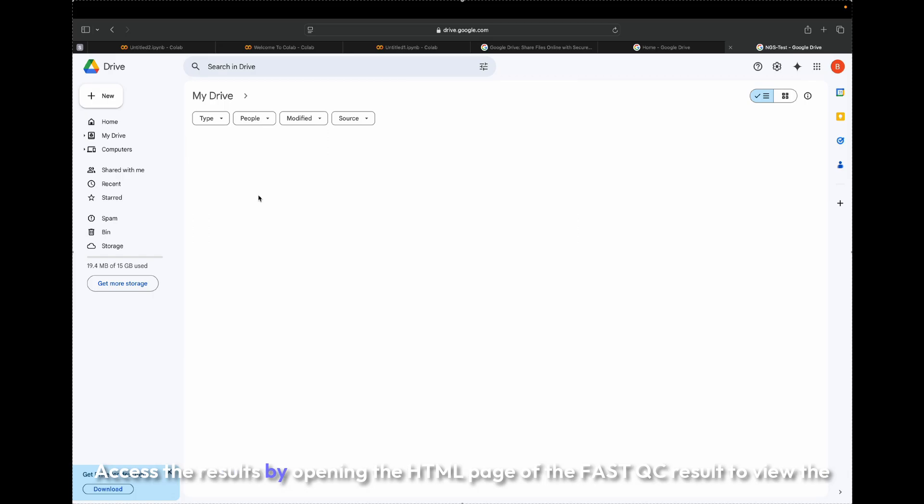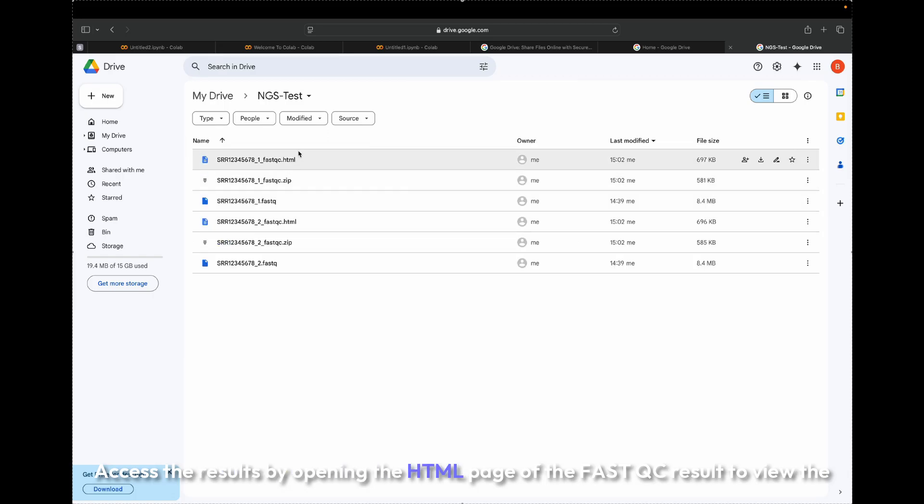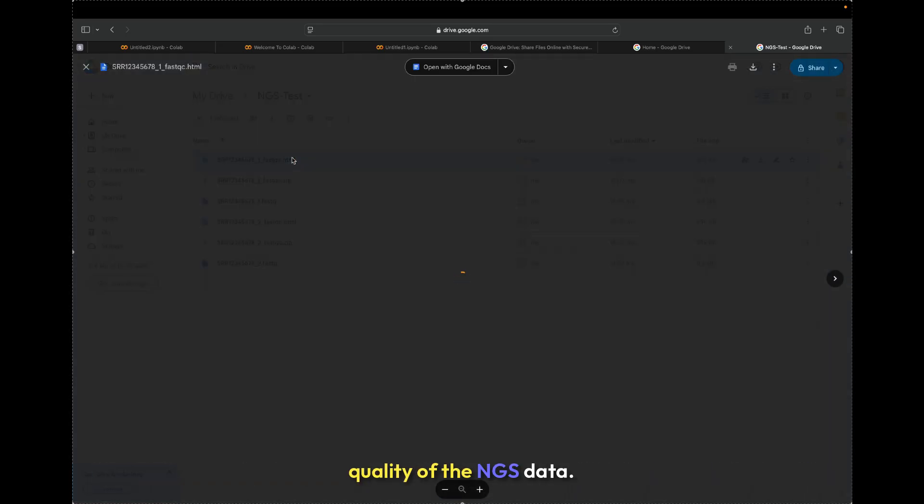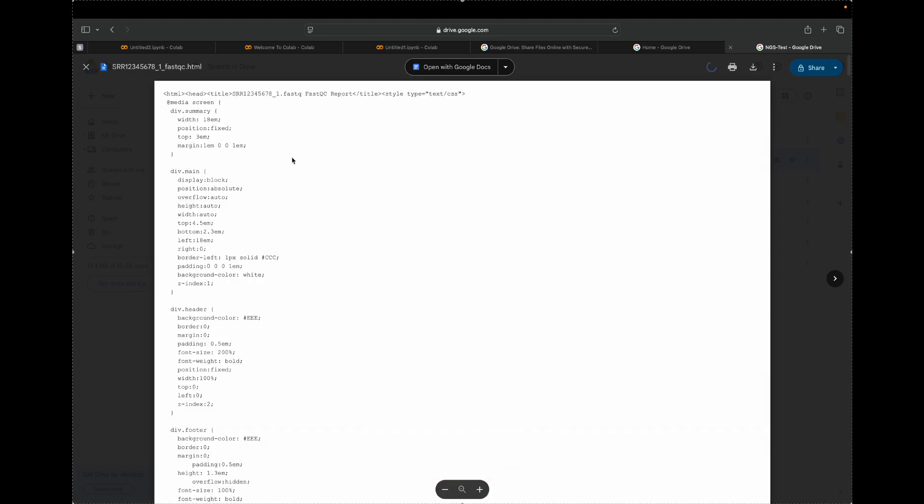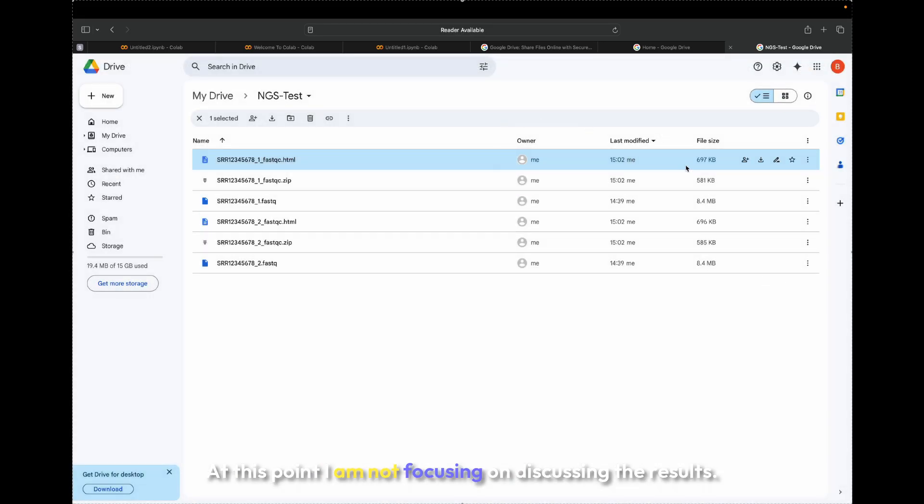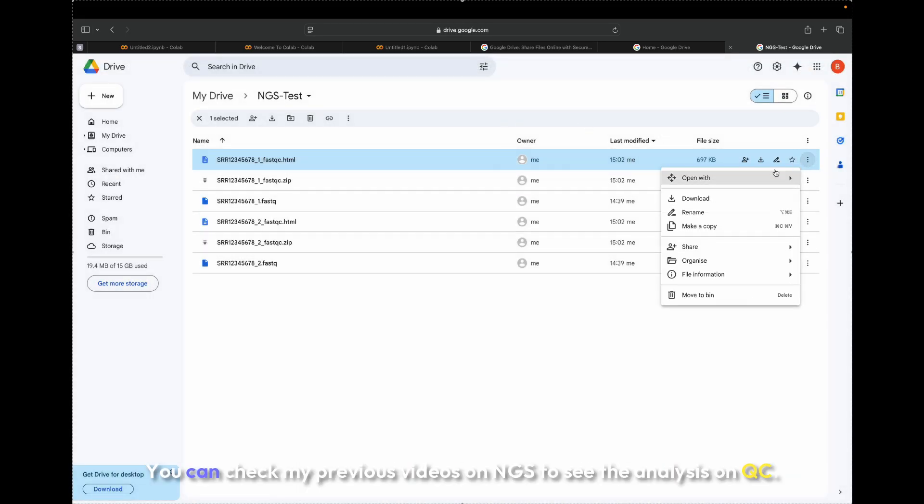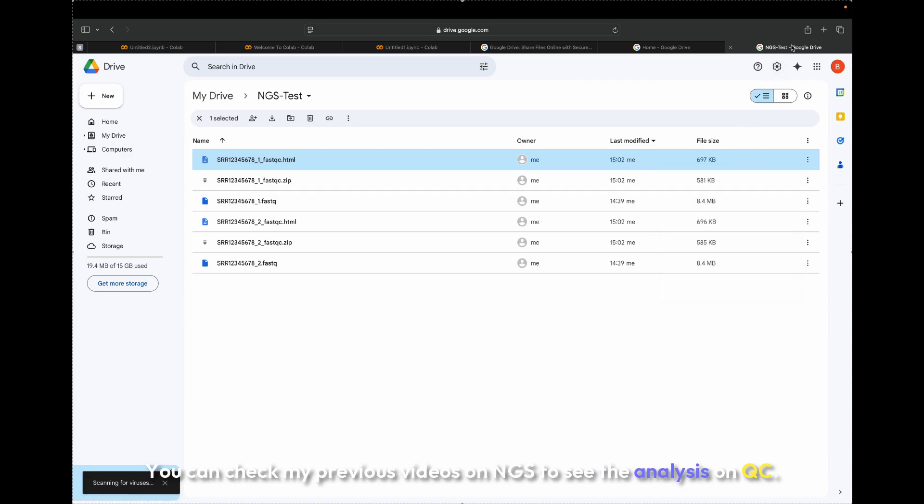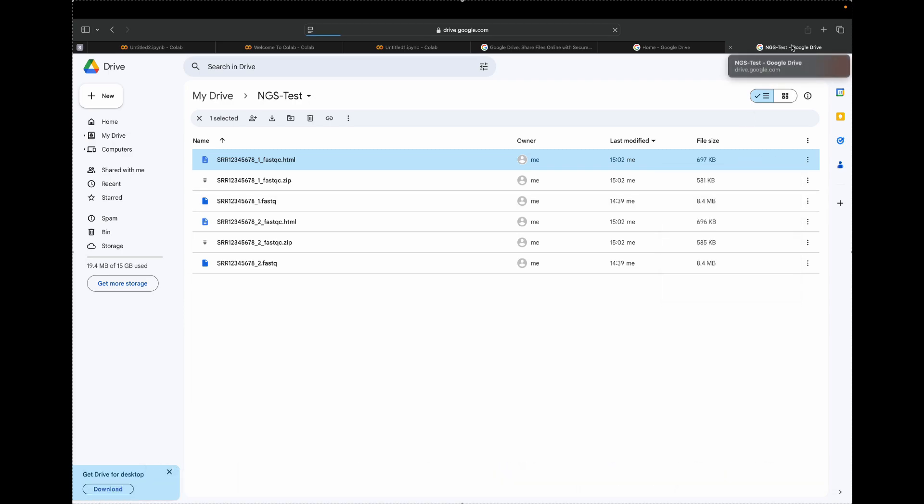Access the results by opening the HTML page of the FastQC result to view the quality of the NGS data. At this point, I am not focusing on discussing the results. You can check my previous videos on NGS to see the analysis on QC.